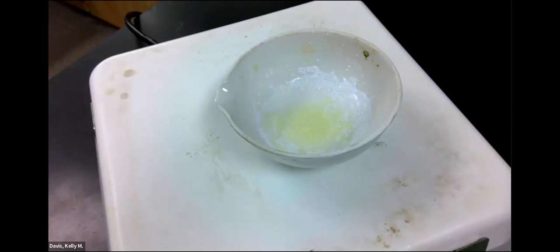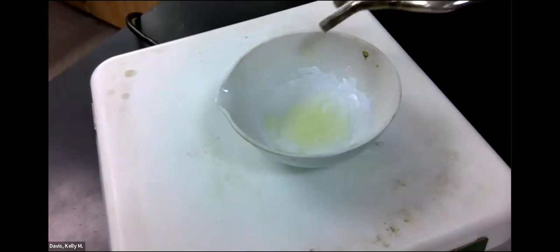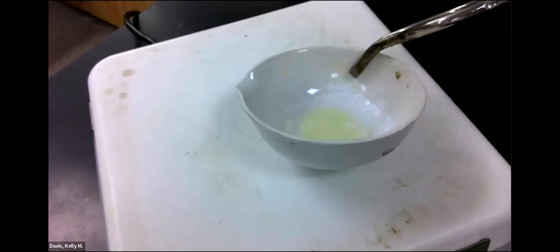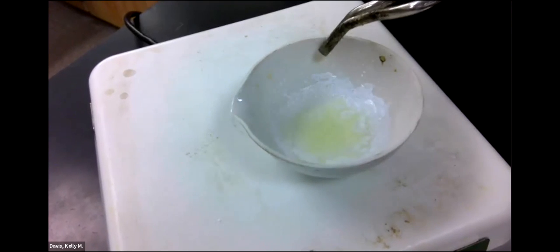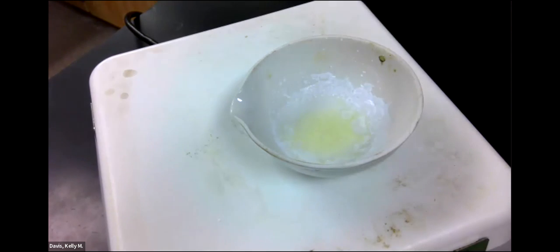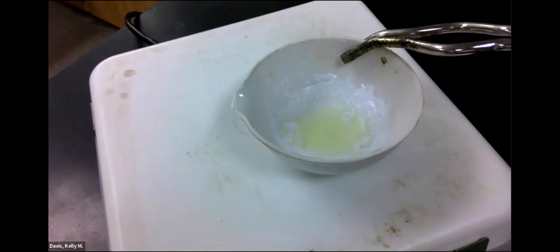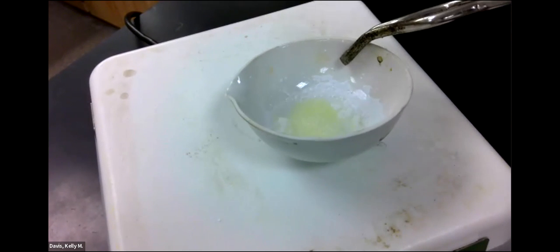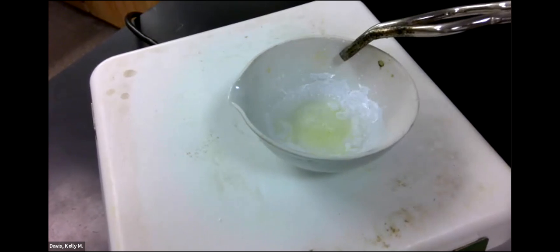All right, so it is mostly all evaporated. There's still little bits of water left. So I'm going to keep that on there for a few more minutes. You can see a lot of white formed around the edges. That's the magnesium chloride. There's still a little bit of water boiling there. It's hard to get all the water out.